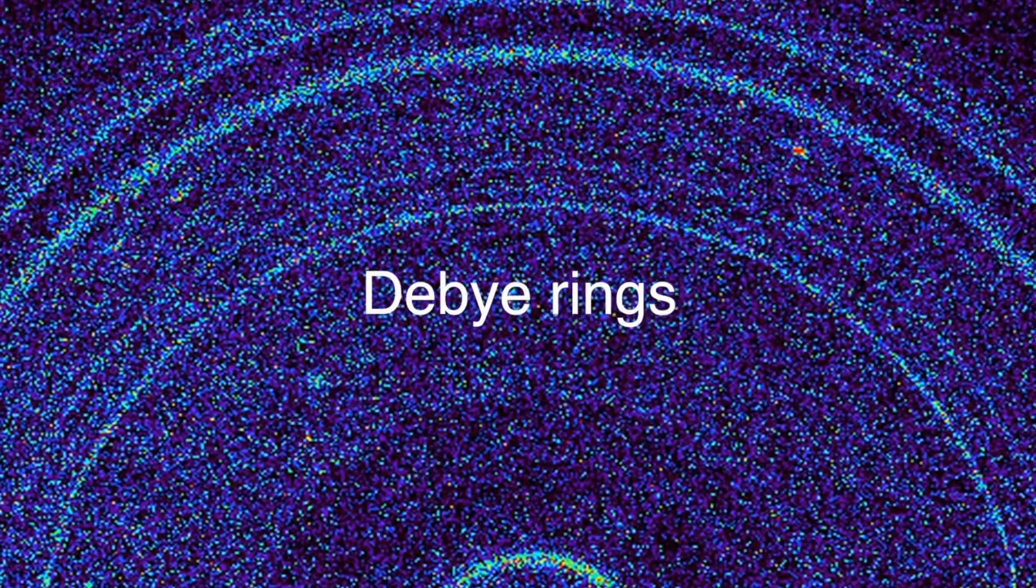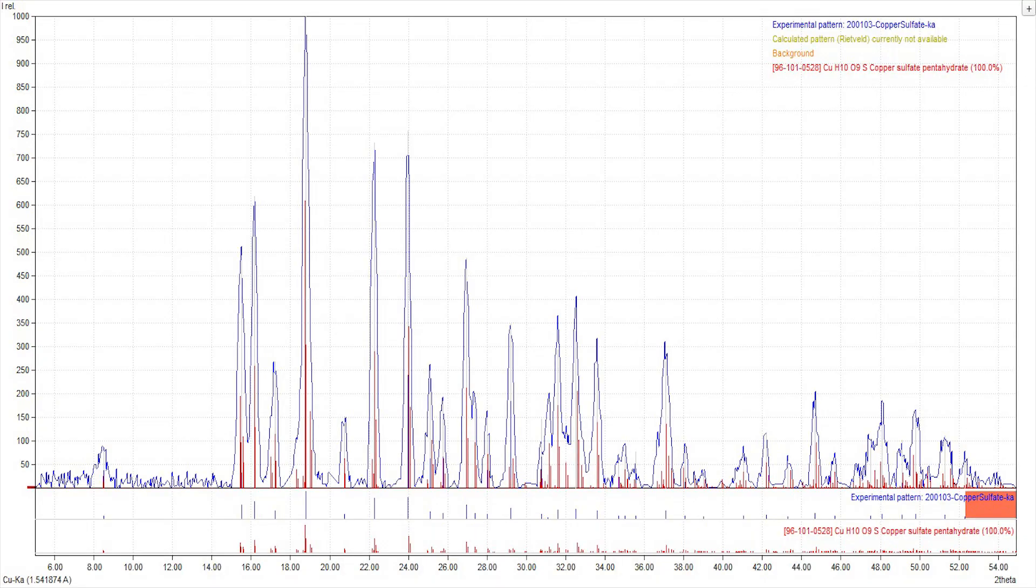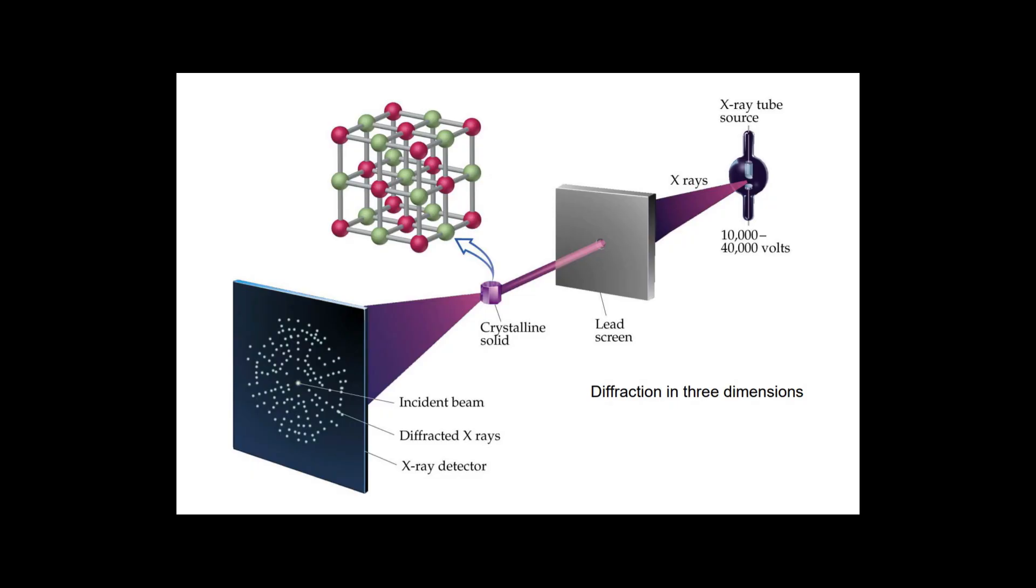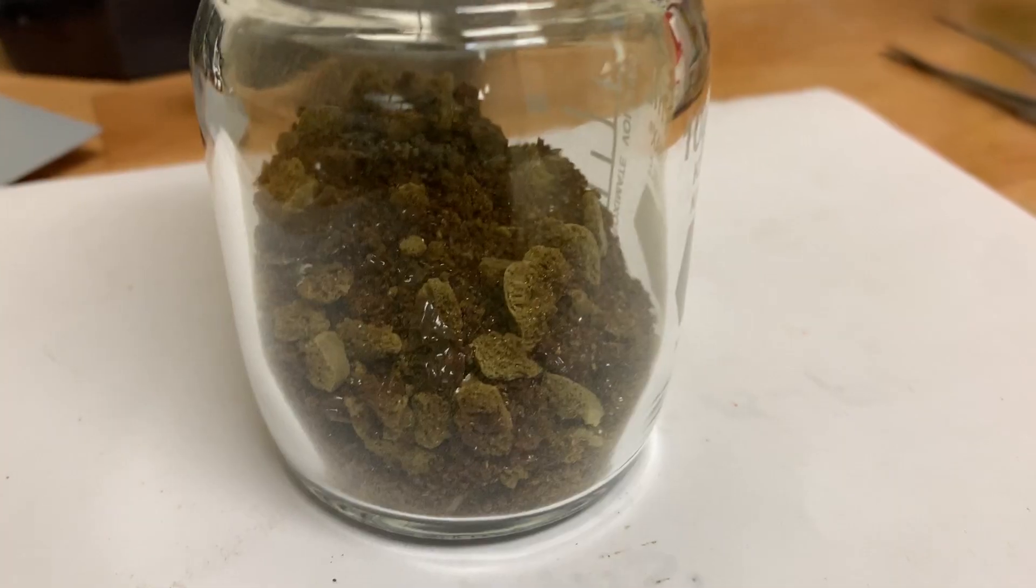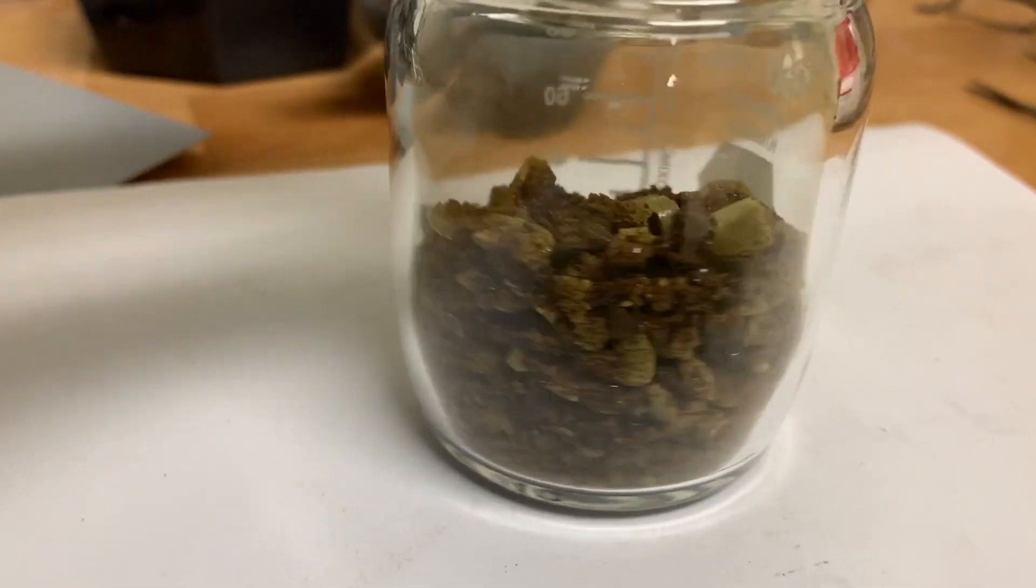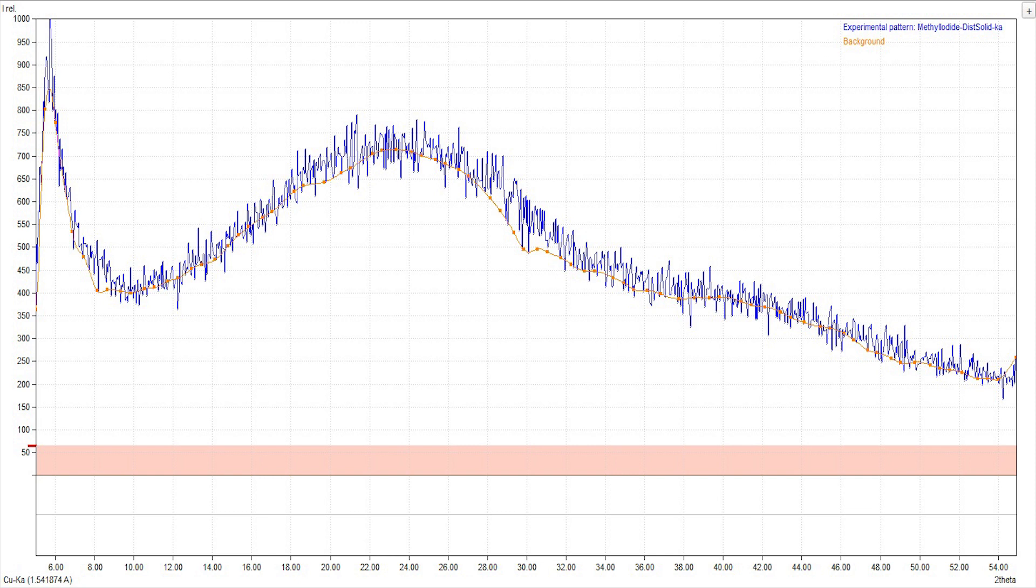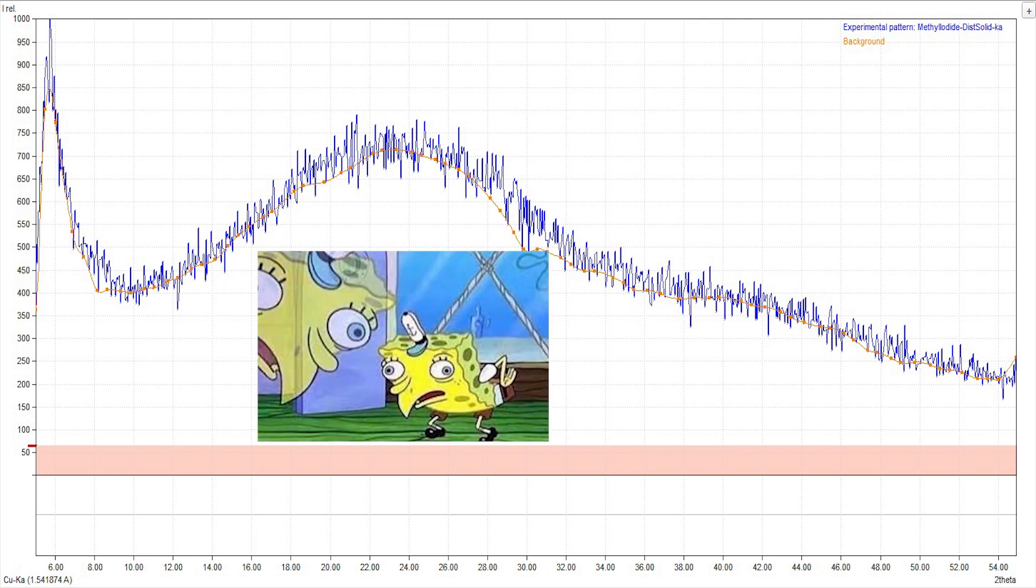It's important to remember this only works if you have a crystal to diffract the X-rays. No crystal, no pattern. In the instance of this material here, after I spent the time crushing it, sieving it, and running it, the pattern I got looks like this, which means no crystal. It's an amorphous structure, which also means I can't identify it using this method.